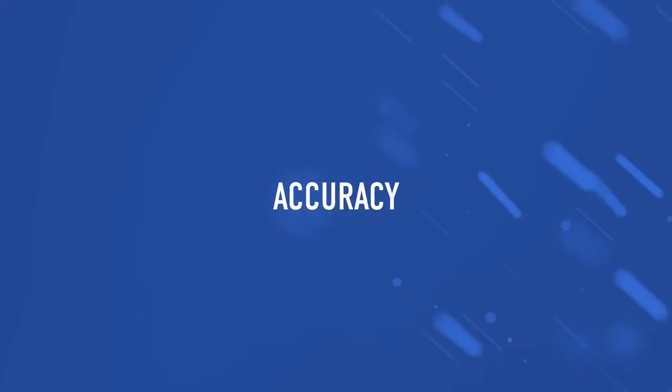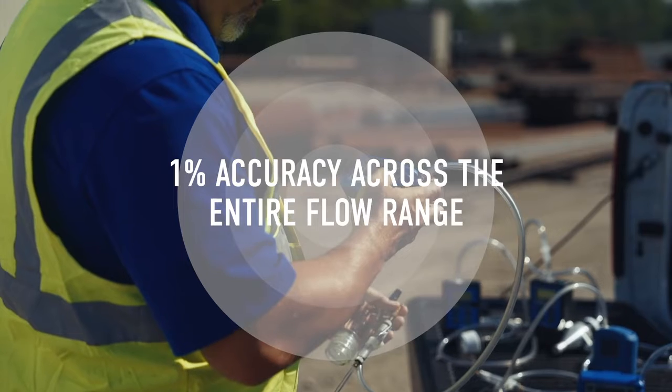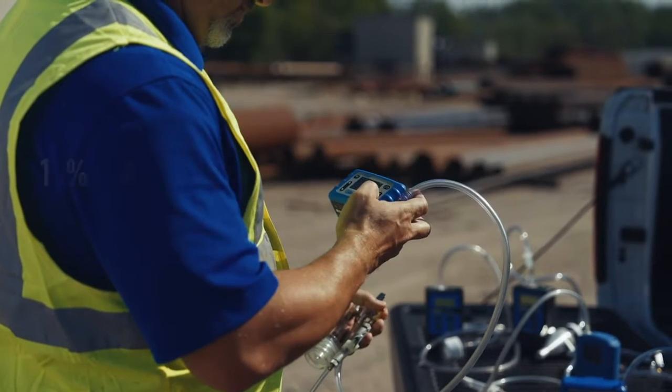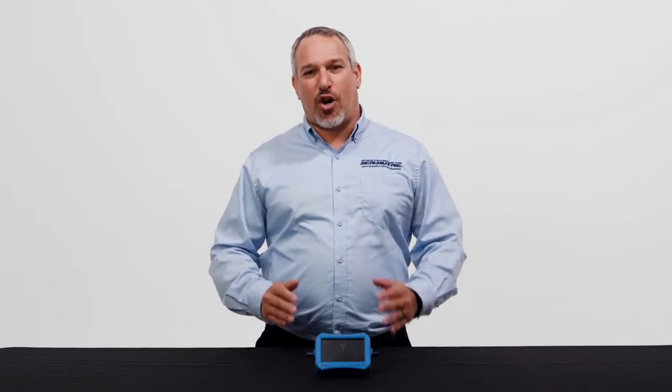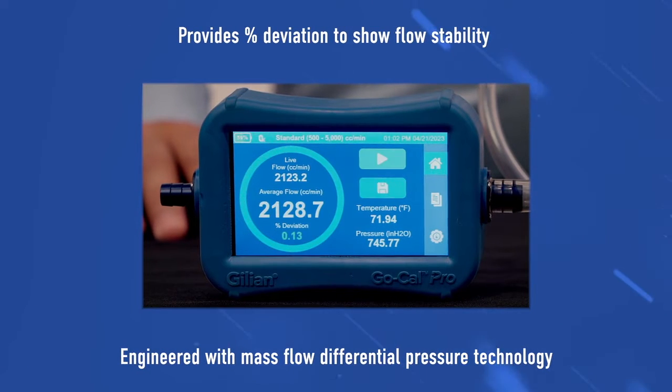Now I'd like to talk to you about the features and benefits of the GoCal Pro. Let's start with accuracy. Each model is 1% accurate across the full flow range of the instrument. This allows the pump to be reliably set to the targeted flow rate. The instrument also provides statistical analysis in the form of percent deviation, which allows you to show the flow stability of the air source being measured.